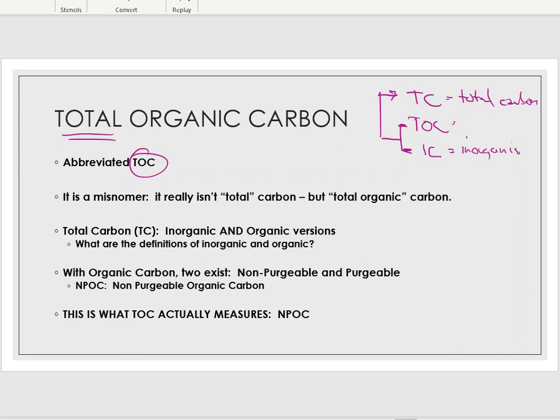All right. Now, this machine is not going to look for total carbon. That is not what it does. This machine will only look for the organic part of carbon. That's it. So the inorganic side of the house, this machine does not normally look for. Now, this is a modification that I can bring into the system, and I can report values of inorganic carbon if I want to. But most of the time, on a routine daily run, we are looking for the organic portion.